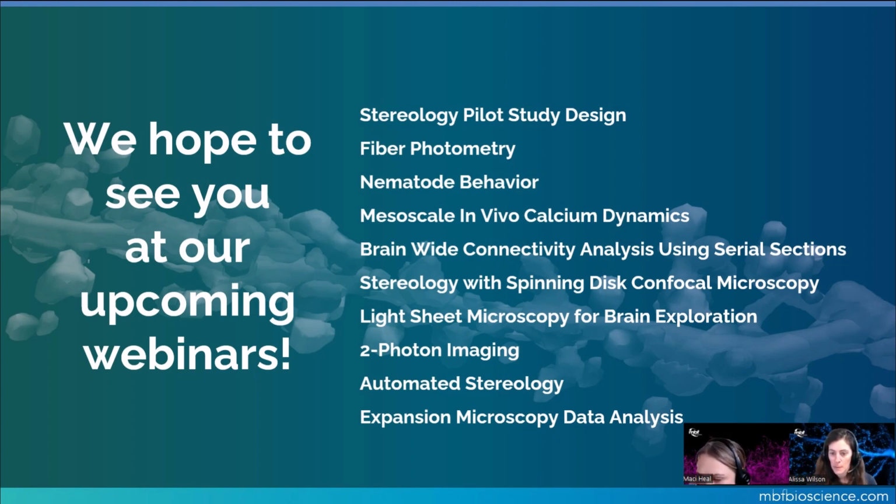Okay, let's see. All right, looks like there's a question about measuring glia and vessel colocalization, or astrocytic end feet coverage of vessels.